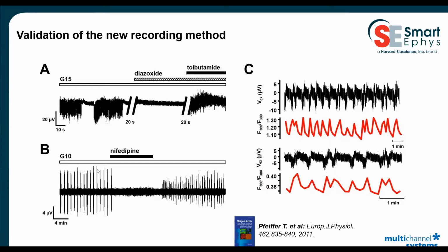And you see that nifedipine inhibited electrical activity, and the effect was reversible after the washout. Oscillatory activity slowly came back. You can see nicely in the end of the trace here.